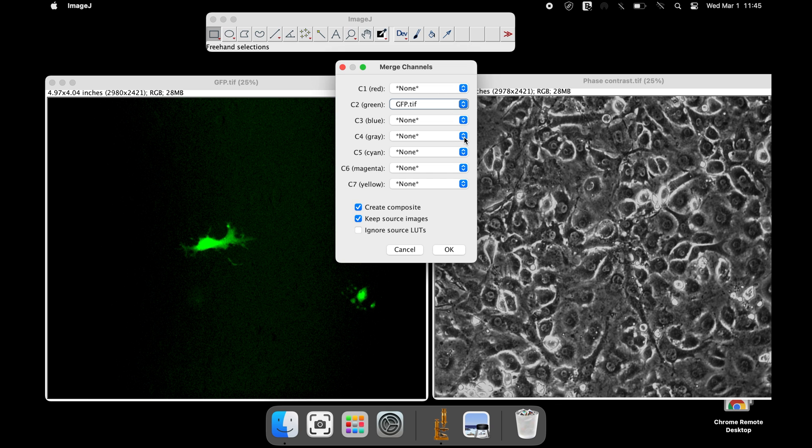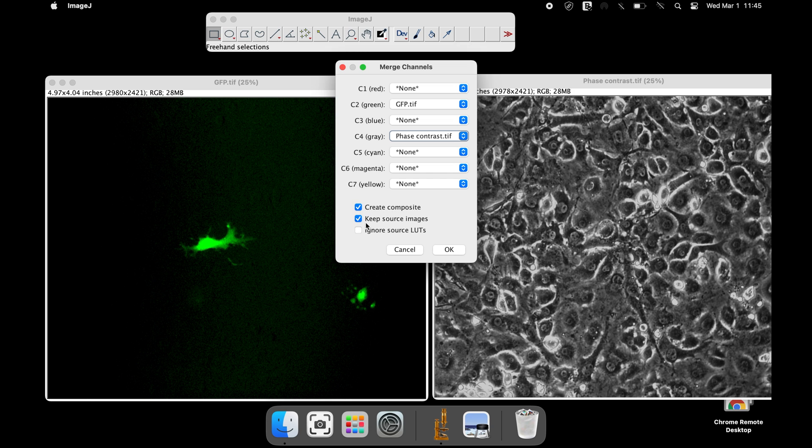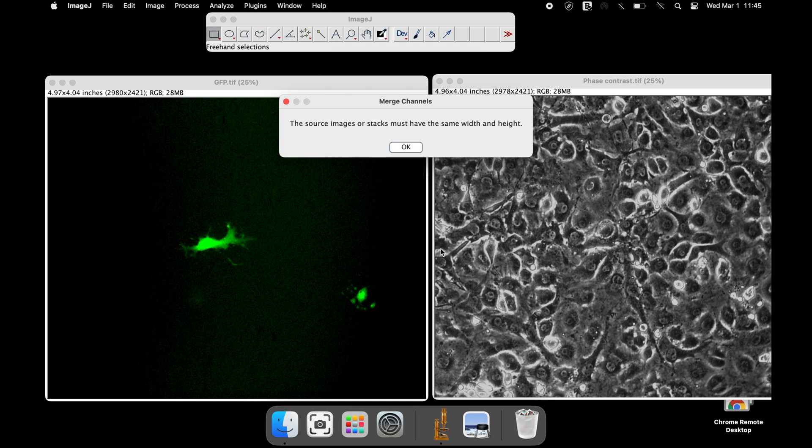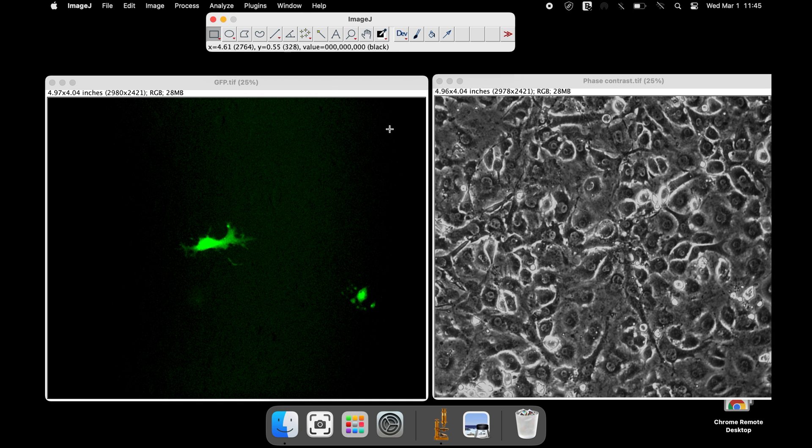In the event of such situation, it is utmost important to have the same sizes for both the images. To check and modify the sizes, click Image, Adjust, and Canvas Size.